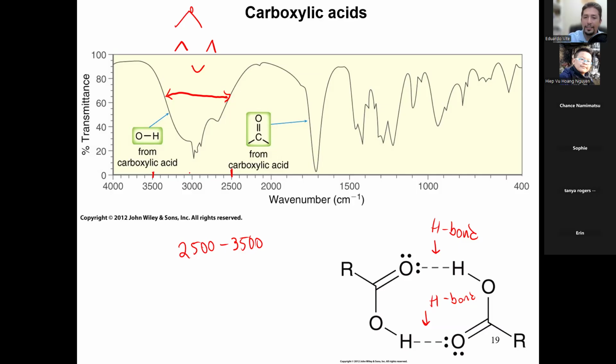What is the beard? What is this at 3000? I've been asking you guys that for every single spectrum. What's this here at 3000? What are those peaks at 3000? They're everywhere. Those are CH. That's right. Those are CH stretches. They are always going to be present.